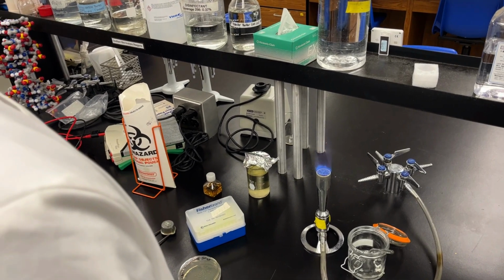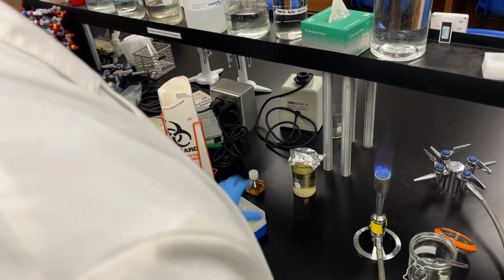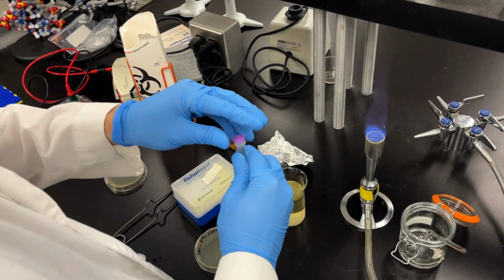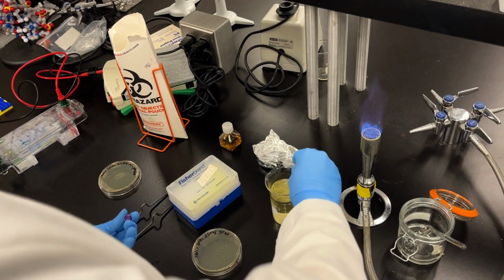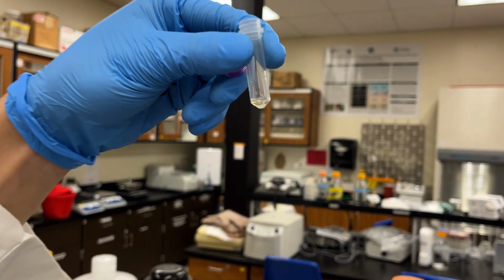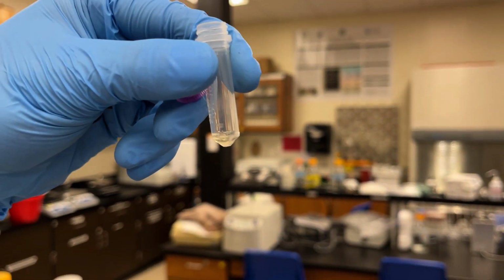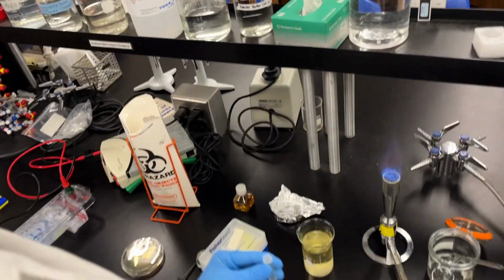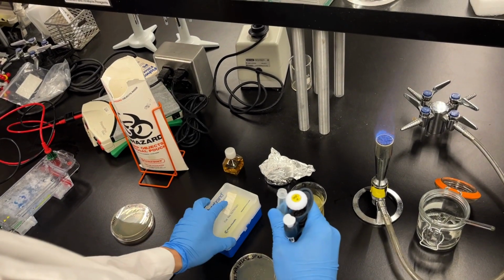So in our hands, generally we plate a small amount, somewhere between 50 to 100 microliters first, and then we plate the rest of the transformation mixture. Now, the problem with that is that the amount is quite large, so we centrifuge it real quickly, 1 minute at maximum speed, and then you just dump out the remaining liquid. Now, you will always have a little bit of liquid left over.